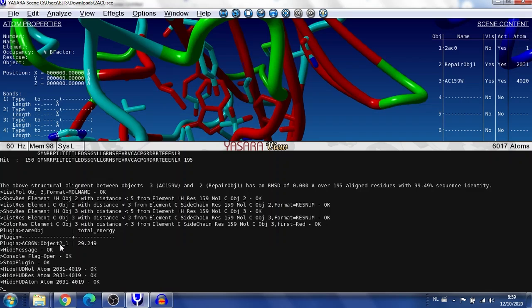So that's a little bit disturbing. This means it's the 86th residue, so that's unfortunate here that it doesn't say the same, but in this case it's exactly what we have been looking at. It's alanine 159, but it's the 86th index, so to say, the 86th amino acid.